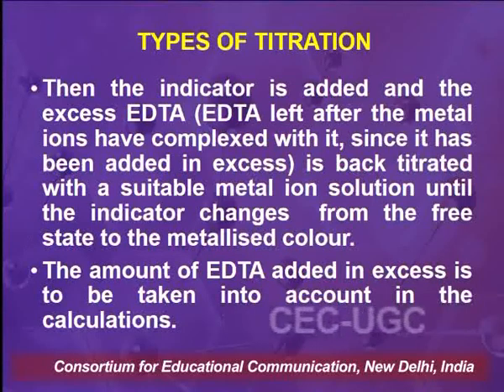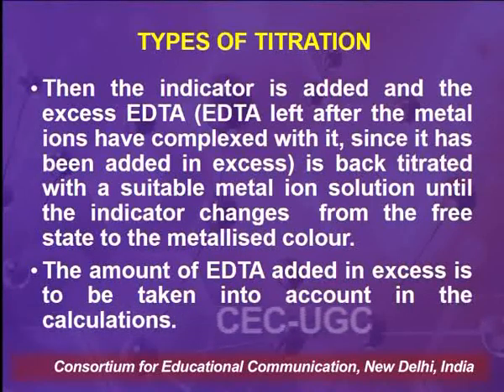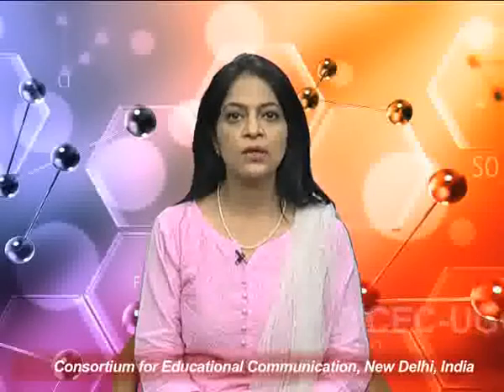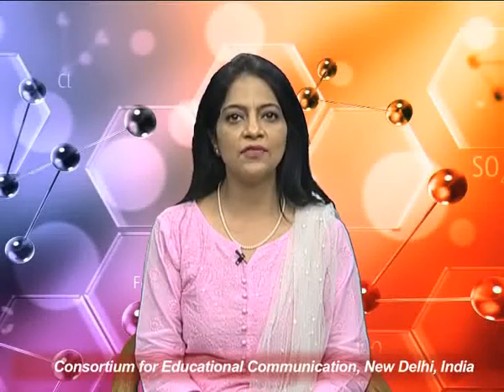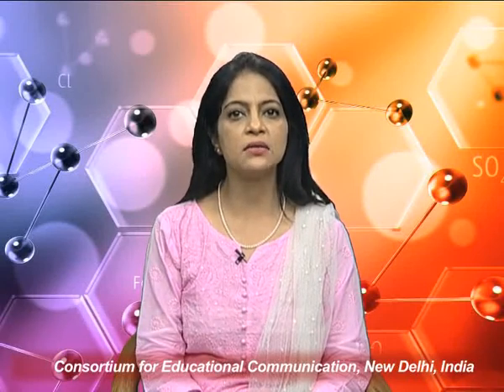So whatever EDTA was required to form a complex with the metal has formed a complex with the metal, and the remaining EDTA which has been added in excess is left out. So whatever EDTA is left out is back titrated with a suitable metal ion solution.